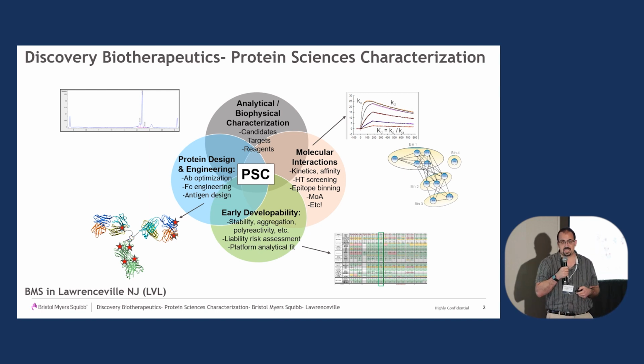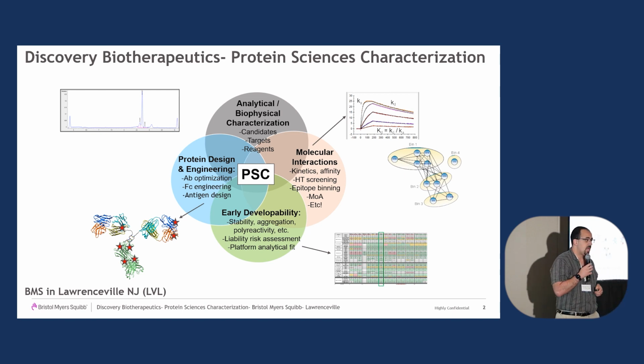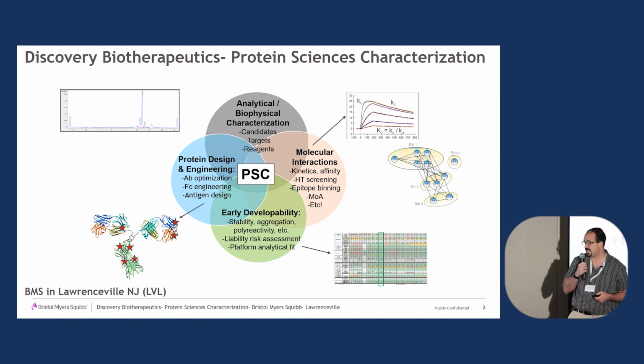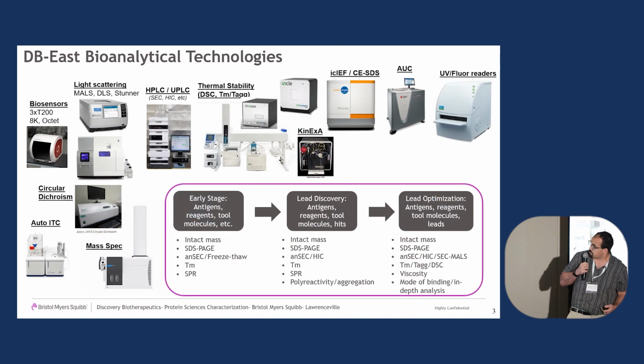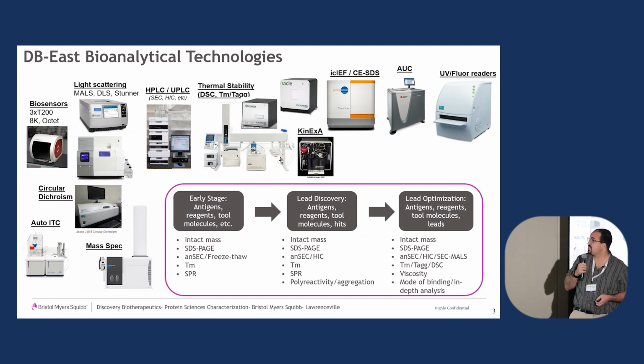So a lot of our work is focused on antibodies, and not just antibodies, but different modalities, whether that be bispecifics, antibody-drug conjugates, Fabs, etc. We have a wide variety of techniques and instrumentation to take a look at these things.